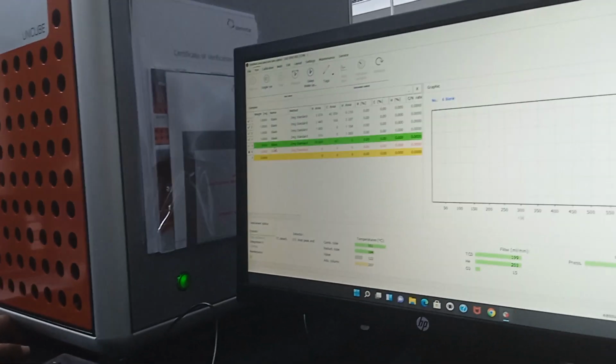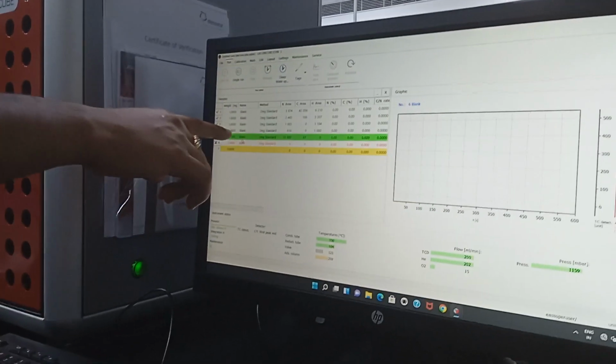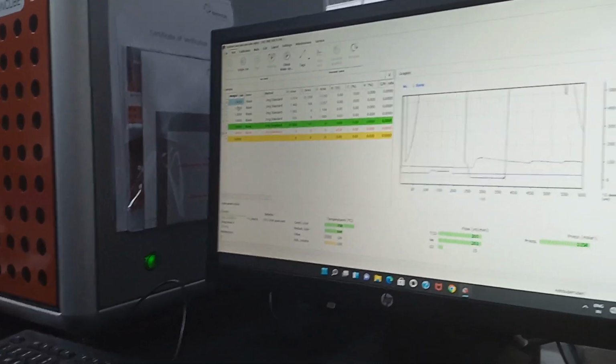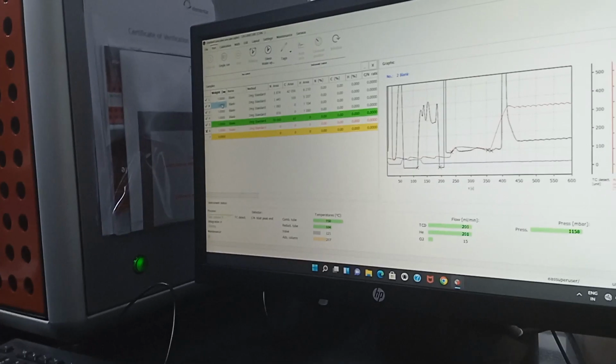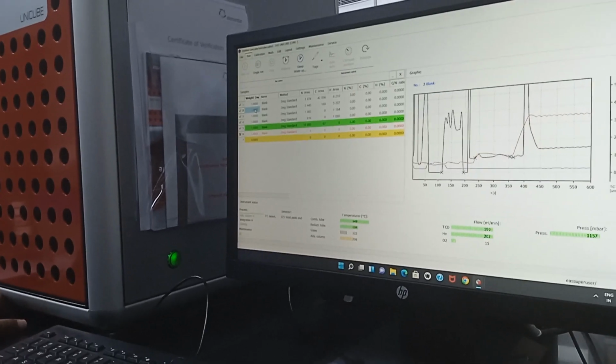Here there is a balance with a 1 mg default value, and you cannot change it. This is put in for the blank. Or else it doesn't take it if it is 0, so something should be a number.